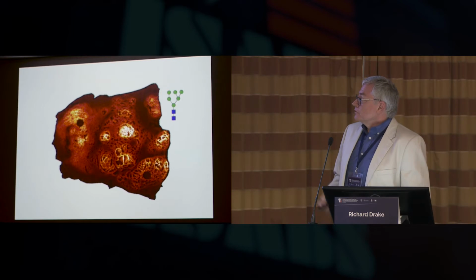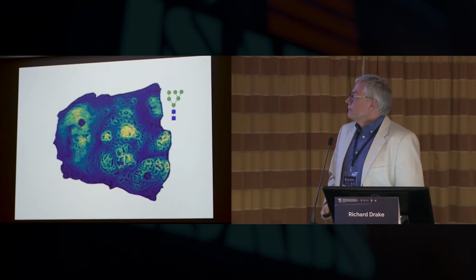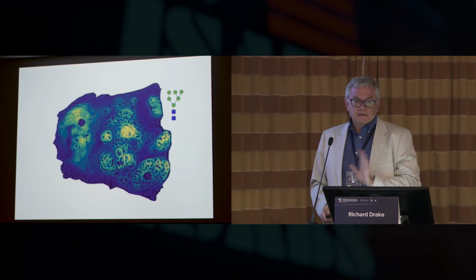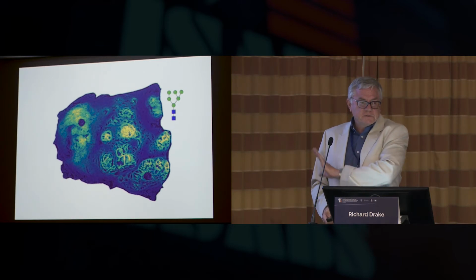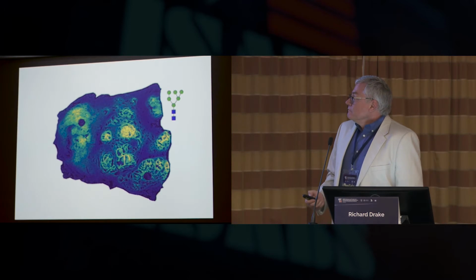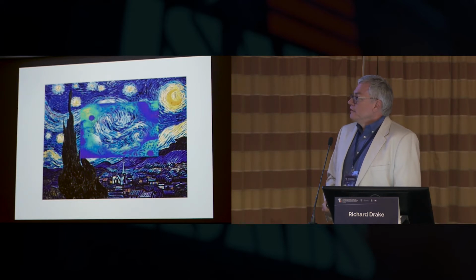We've also got some initial ion mobility data. You can separate the high mannose isomers, and that's a whole other thing that might be interesting. Bruker likes this image now because it's for people with different degrees of color blindness. They like this. I'm still trying to get used to it, but we'll see. It's hard to say, be presumptuous to say that we're looking at any masterpieces yet on our images, or are we?